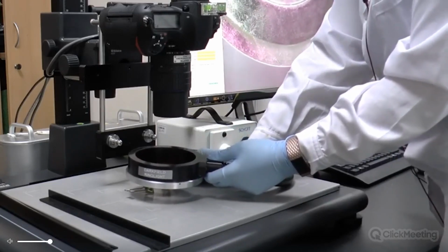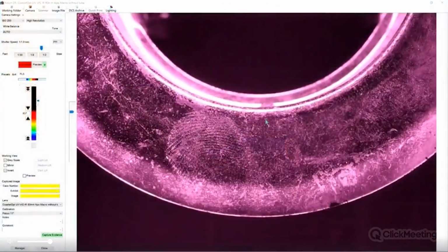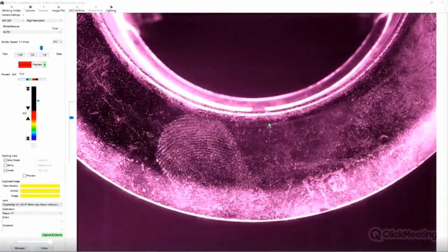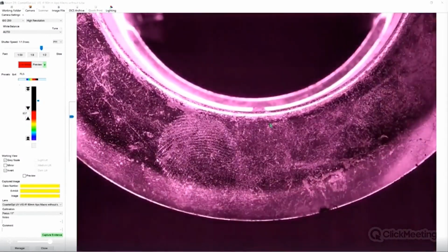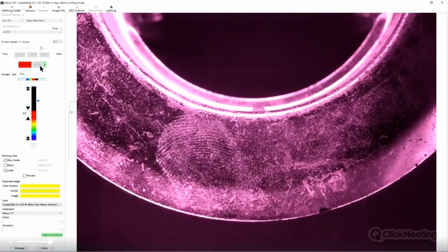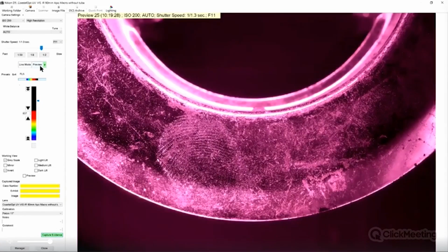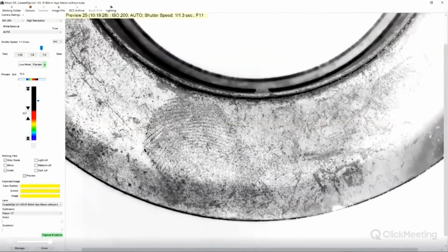And we can start to see finger marks become visible. So we're going to move the dark field up and down around where our finger mark is situated so we can get the best illumination. We can take a preview. Then change to grayscale, and there is one of our finger marks.